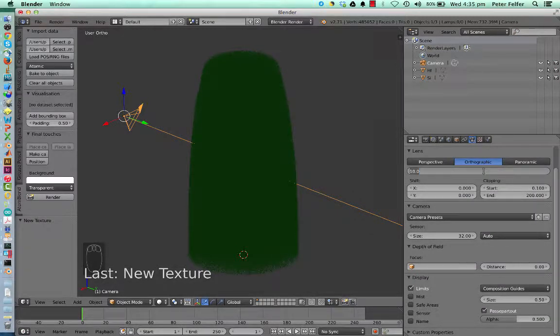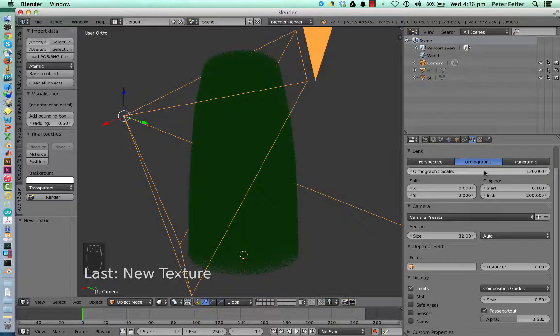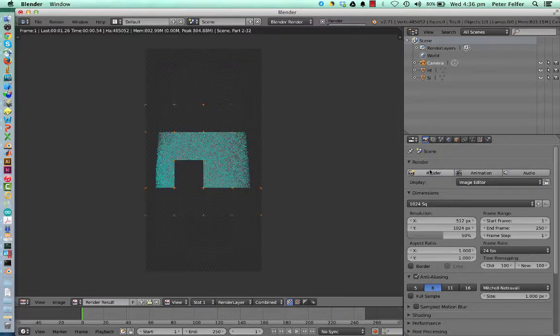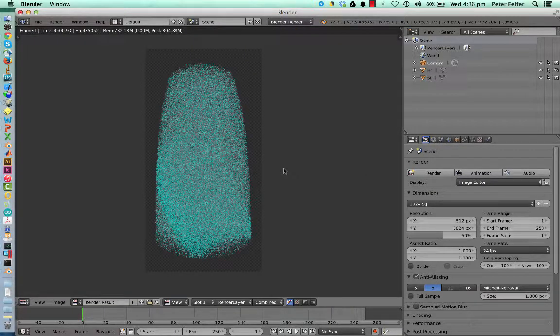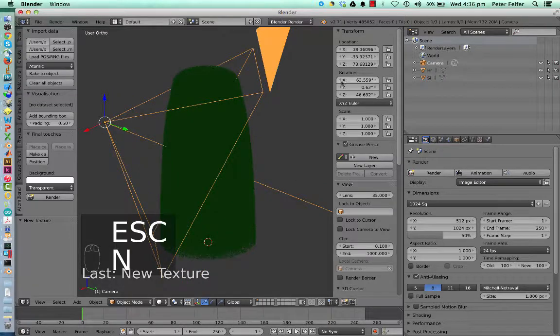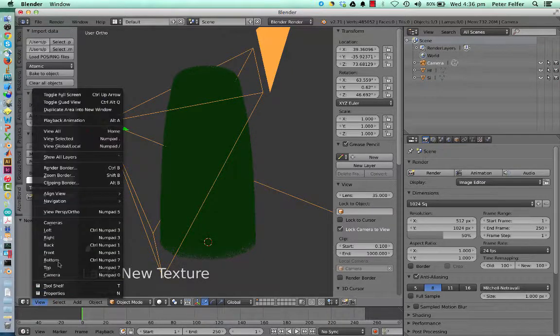And I've been preferring it for a while now in order to do most of my visualization. But occasionally, like in the case of the nanoparticles, you come across a case where you want to do it differently. So you can see this is now a grain boundary, and we'll just move it so that you can look from the side.